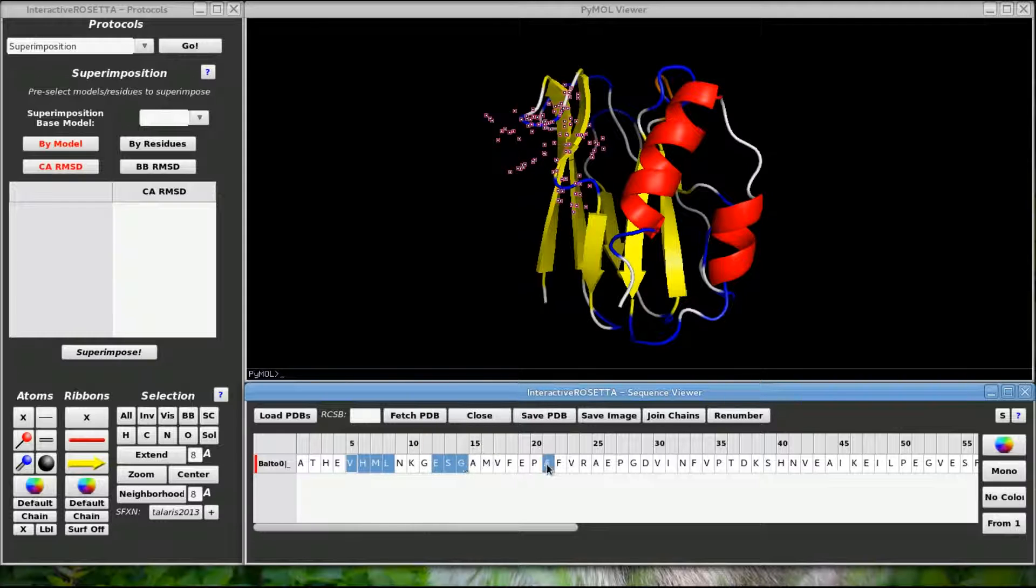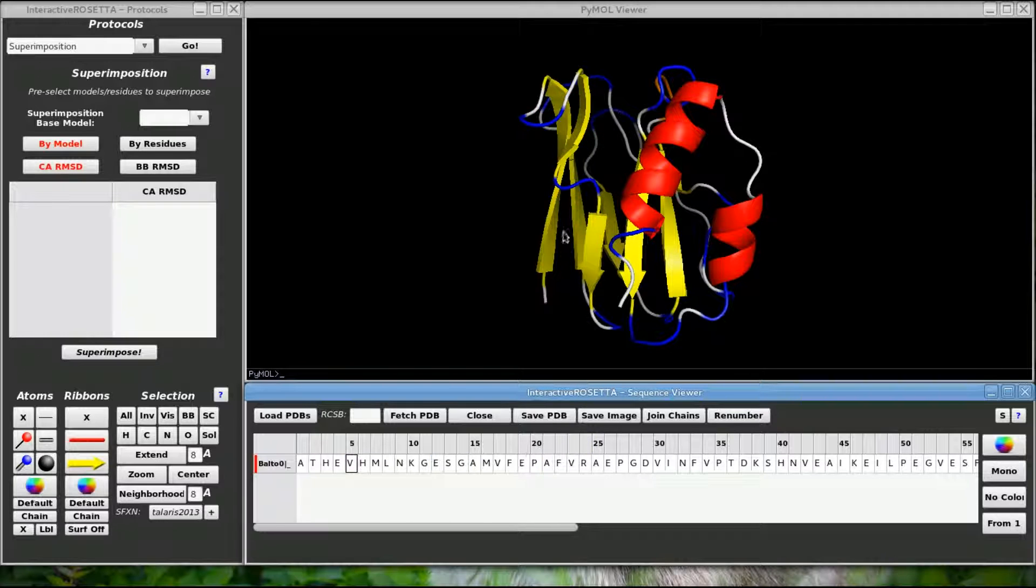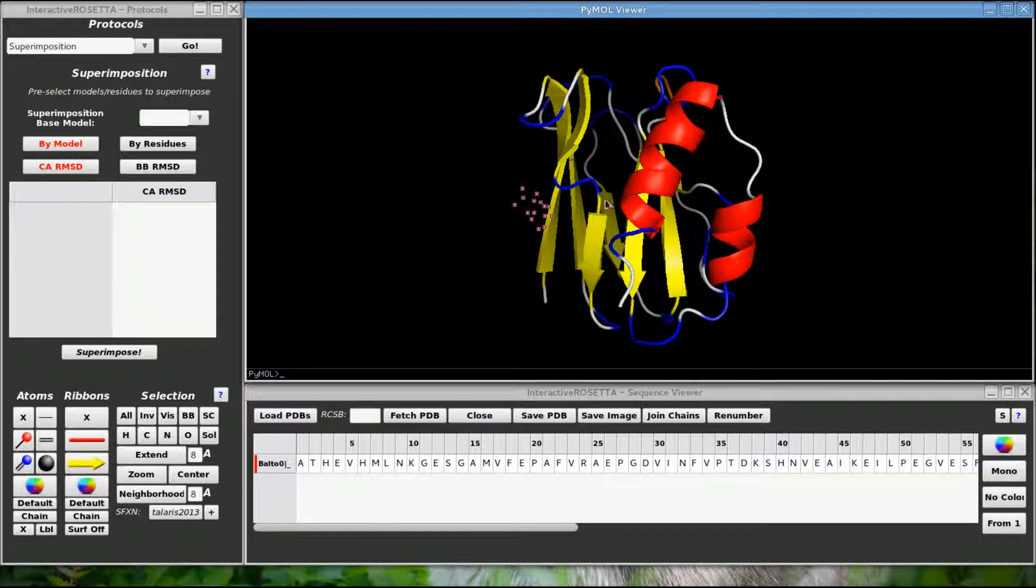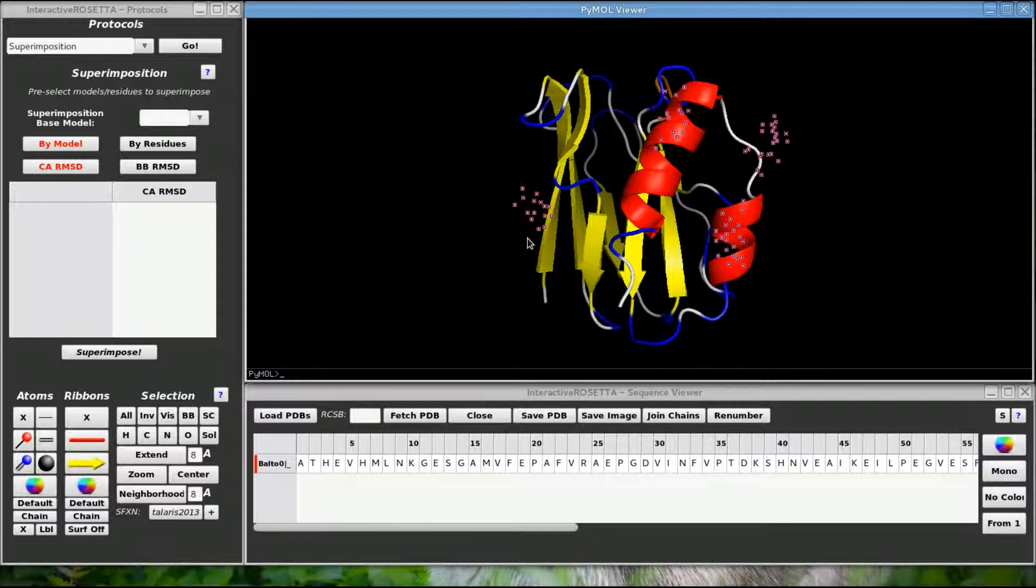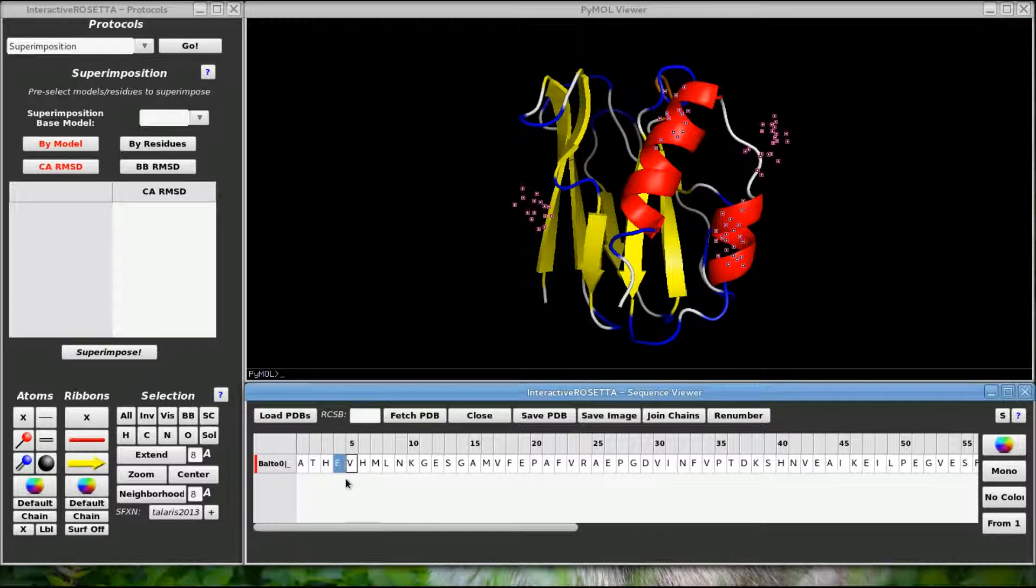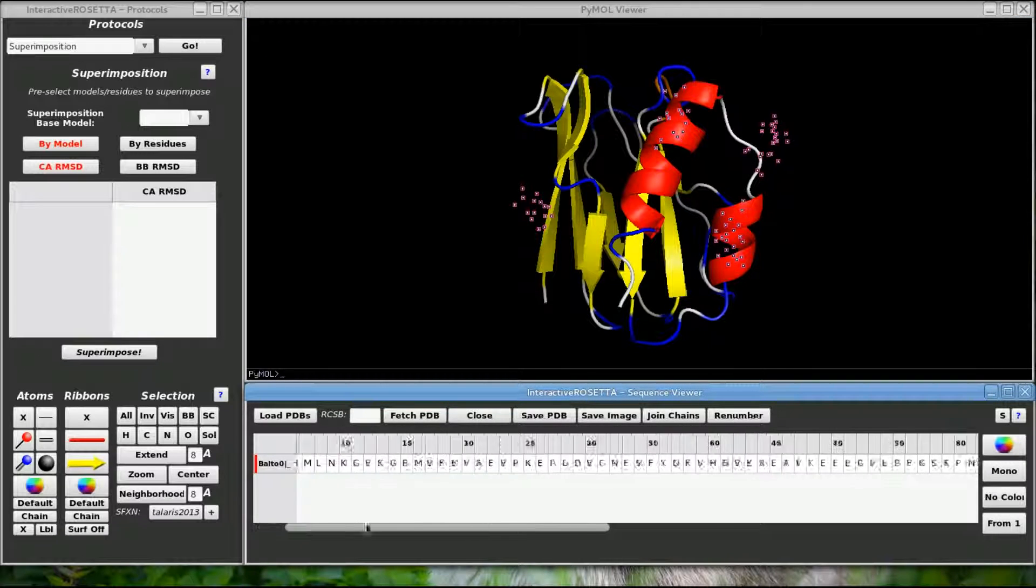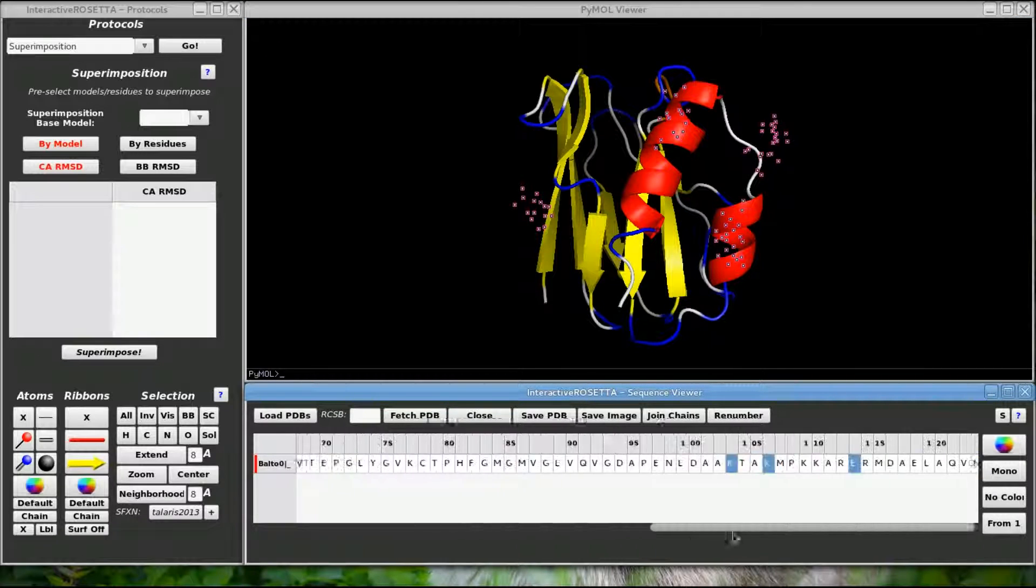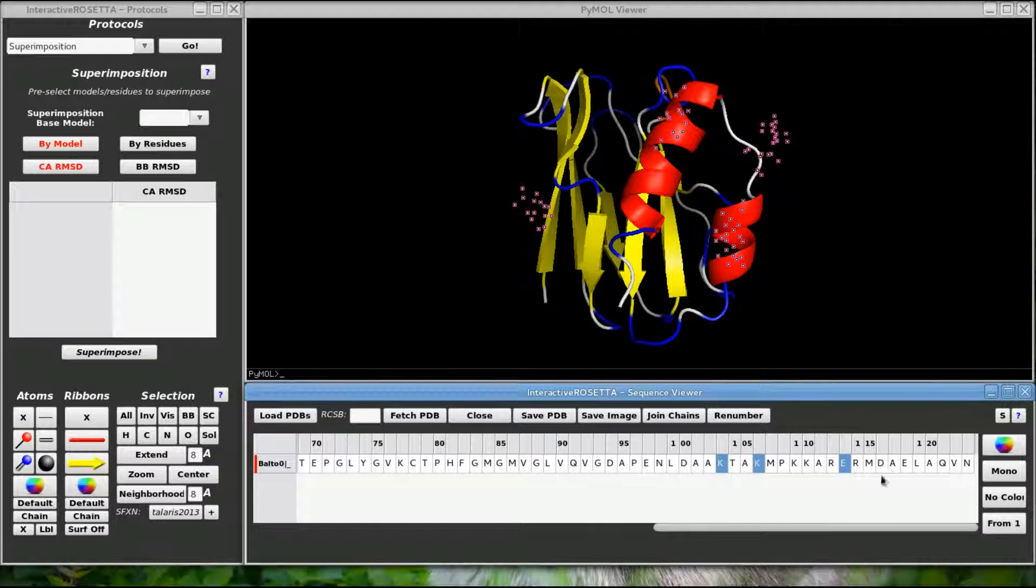You may also select things directly in the Pymol window. Unfortunately, I was unable to figure out how to manipulate Pymol's API to have real-time synchronization. Whenever you leave the Pymol window, it will synchronize the selection, so keep that in mind.